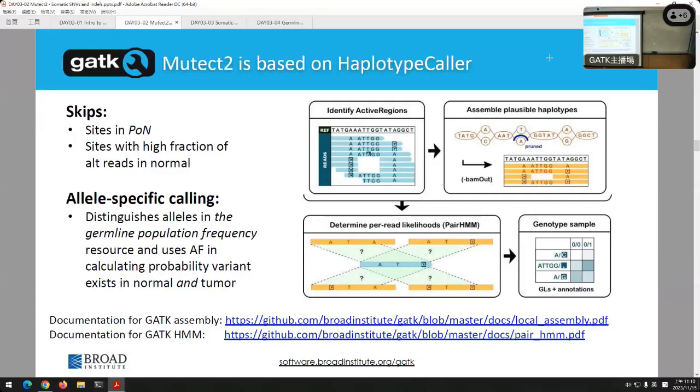But on the germline side, sometimes you have low coverage. So there are things that complicate the quality of it there. We're fairly permissive. If we see something over there in combination with our background frequencies, we're more likely to give it weight here. It's different than the normal haplotype caller, okay? And the idea is, again, minimizing false positives.